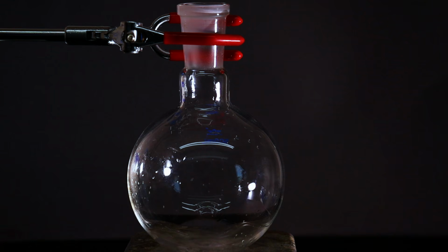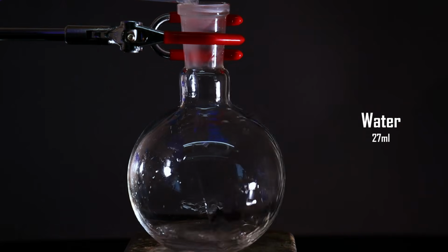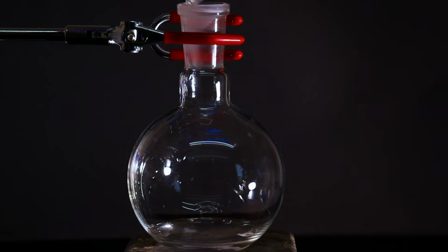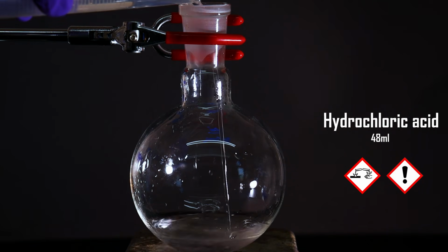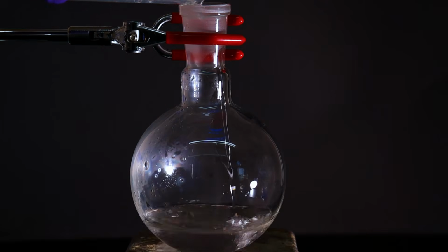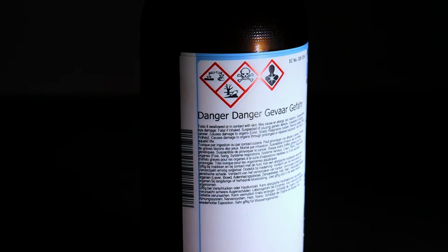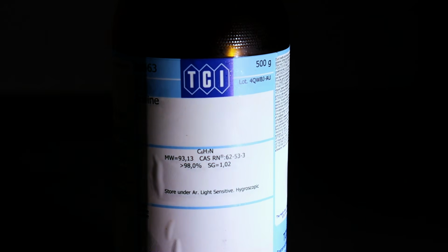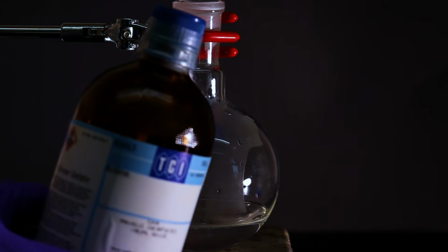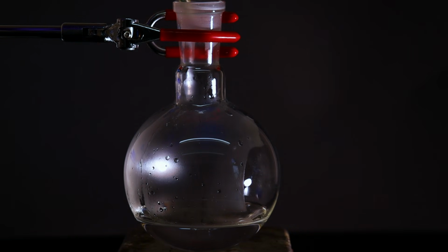To begin, I set up a round bottom flask and poured in 27 ml of distilled water. To this, I then added 48 milliliters of concentrated hydrochloric acid and enabled magnetic stirring. For the next step, we will need some aniline. This reagent is even more useful than phenylhydrazine, and it is also quite toxic. Interestingly, it also shares some use in rockets with hydrazine, as it was tested in some old hypergolic rocket engines. Anyway, I measured out 6.5 ml of cold aniline, and I added it to the acid.